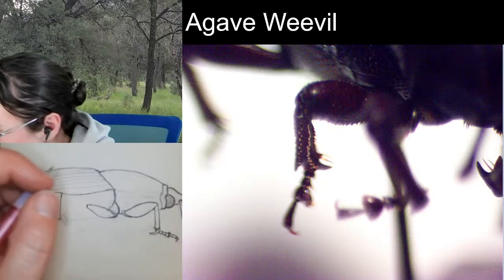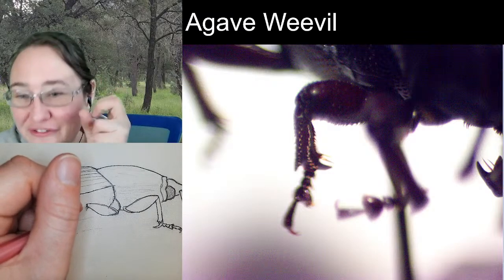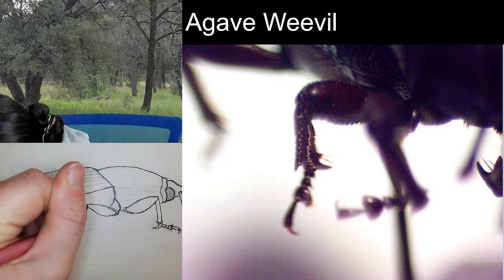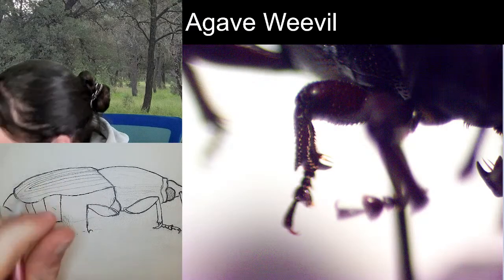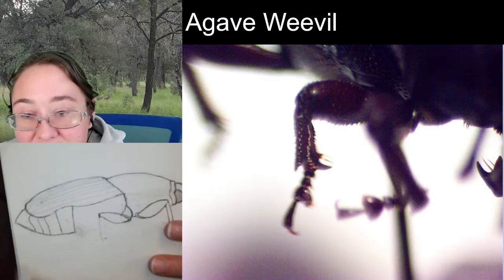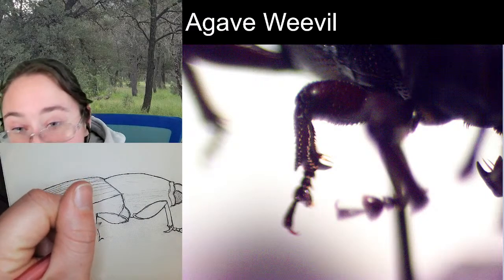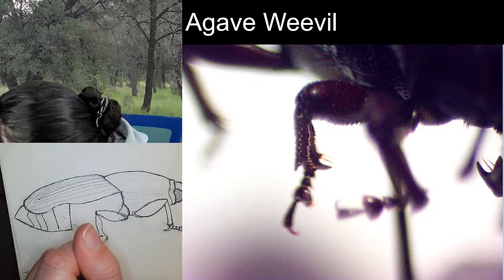Alright, then we've got this really cool tibia-looking doodad. On the left side, it's kind of forward-facing. It's the front of the tibia. It's just that the tibia is facing backwards at the moment. Spine. Kind of like that, maybe. Give me a minute on my spine. It has to come in a little bit. So it goes out, comes in a little bit, and then you get the spine. That's much better. And then it starts narrow. You've got this outward arch, and then it comes in, and you've got a double spine.